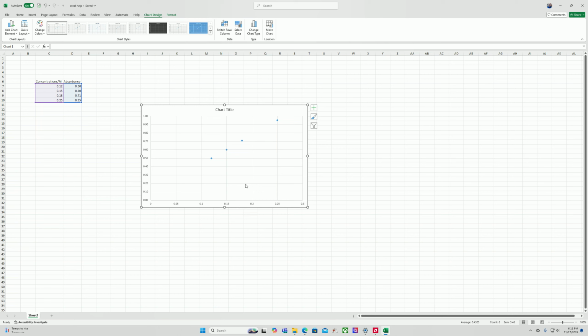Okay, now this is a bit of information, but it's not an analyzed graph, and so we're going to go over the details associated with that. We're not going to plot these by hand, so these grid points are meaningless, so I like to delete them just to make our graph look nicer. We like to minimize dead space in our graph, and dead space would be these areas right here that don't have any dots in them.